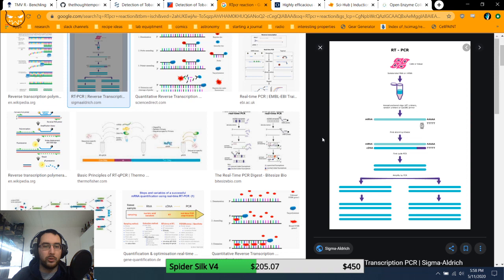And one of the reasons why this is really frustrating is because one of the things that contaminates essentially everything is something called RNase, which is a protein, and it destroys RNA. That's its whole job. Unfortunately, RNase is aggressively stable. I can autoclave it for hours and it won't break down. It's stable up to something like 140 degrees, so I literally can't get an autoclave hot enough to destroy this stuff. And the same things that would destroy it would ruin my sample. The problem is it's on your skin, it's in dust, it's in the air, it's on every surface. It's all over the place. So it ruins RNA samples, and it's an absolute terror.